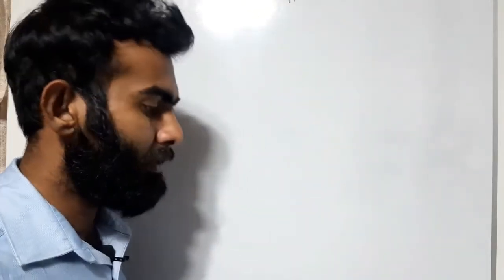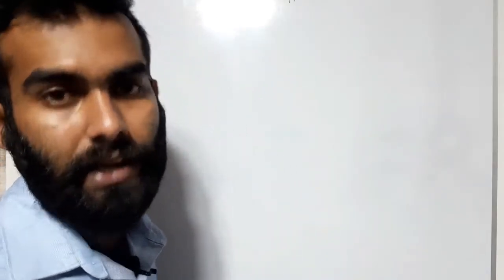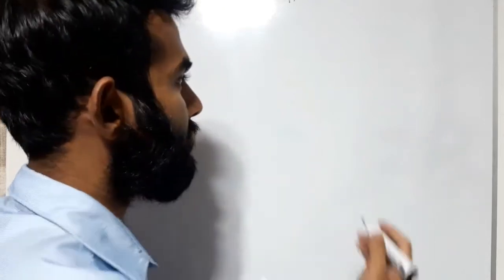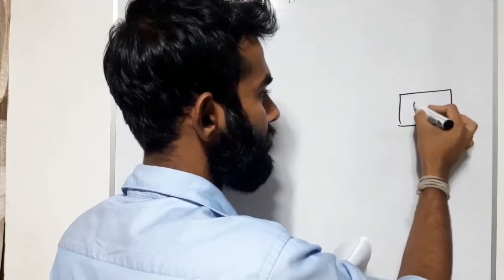Okay, experiment number 5 is determination of the endpoint of a titration and solubility product using conductometry. Here we will discuss only the first experiment, to determine the endpoint of a reaction by using conductometric experiments. So we will use a conductivity meter.